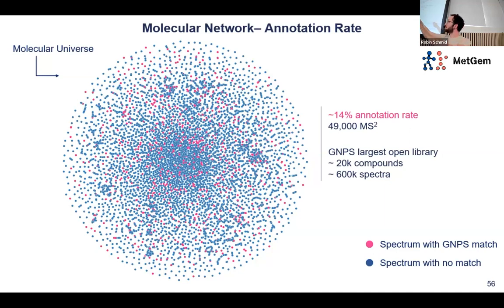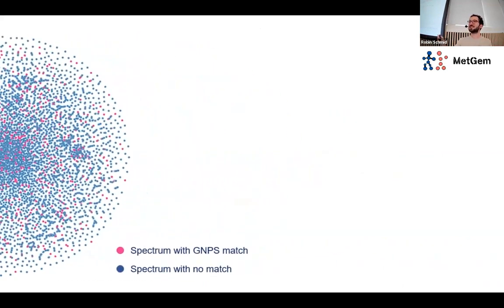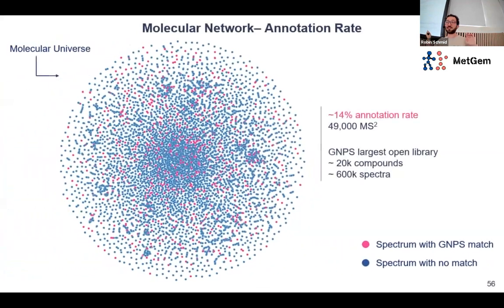And in this view, usually things that are close together should be very similar, but there's no way to see that something that is up there might also be similar to other things. Yeah, just want to make you aware that all the representations flatten a very multidimensional space, and it's very hard to do. And the whole idea that I didn't tell about was the annotation rate here was actually quite low.